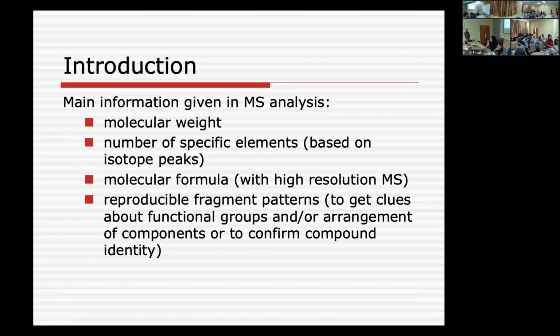Tadi kita lihat pada puncak yang utama, kalau flavonoid, jelas flavonoid itu hanya pemutusan retro Diels-Alder, jadi akan membelah dua molekul yang sama. Dan Diels-Alder itu bagian sinamoil yang paling stabil, jadi merupakan base peak-nya yang utama. Dengan demikian kita sudah mengetahui pola fragmentasi ini adalah kerangka dari flavonoid. Itu bisa kita ketahui dengan mudah dengan menggunakan spektroskopi massa.